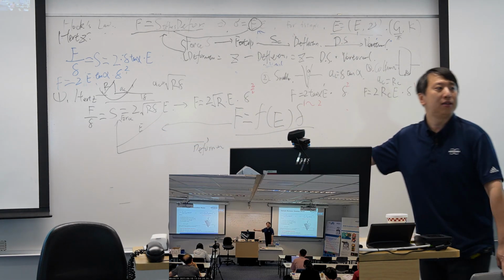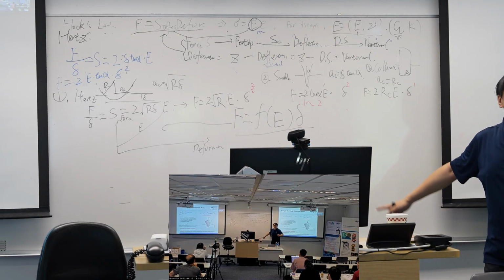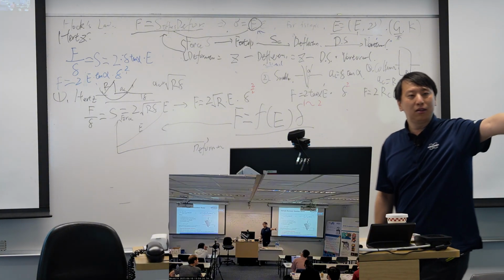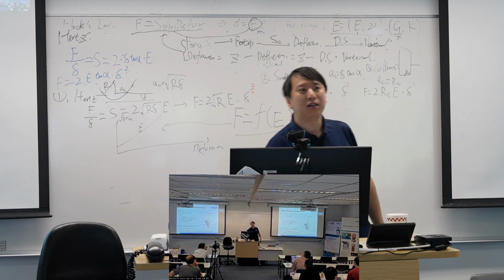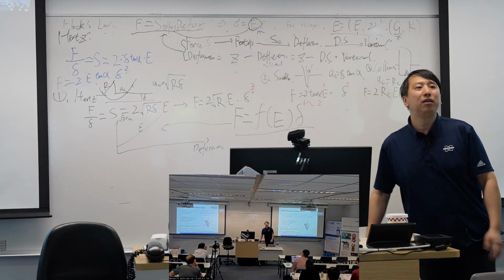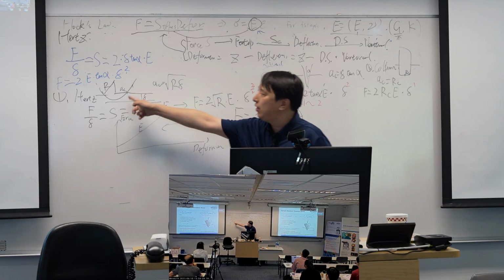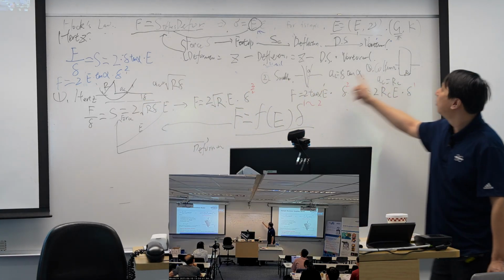That's the key idea. And this one is used on nanoindenters. Because the probe, the stylus on a nanoindenter, is a certain diamond, right? The diamond is a crystal. It's hard to cut it into a sphere or a cone or a column.